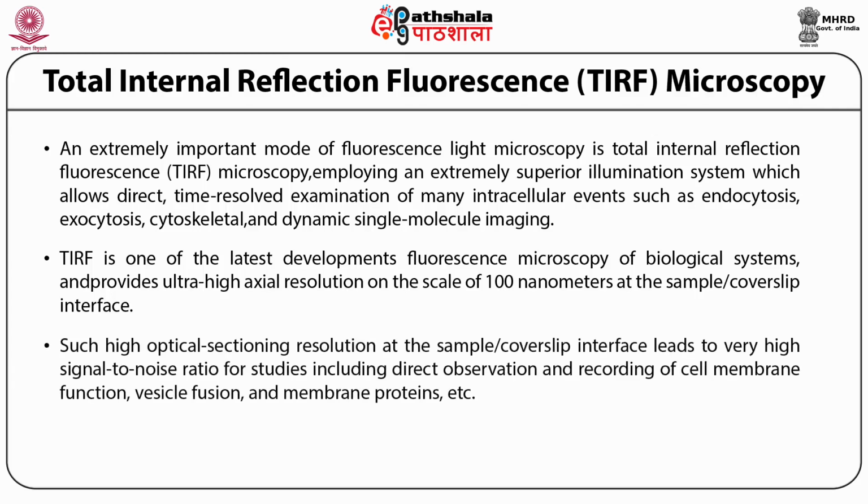Such high optical sectioning resolution at the sample or cover slip interface leads to very high signal to noise ratio for studies including direct observation and recording of cell membrane function, vesicle fusion, and membrane proteins, etc. This microscopy technique is extensively used in experiments involving low signal intensity and fast imaging.